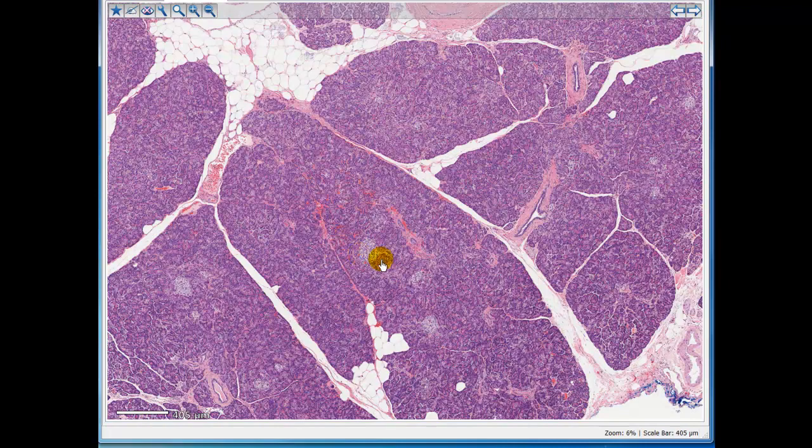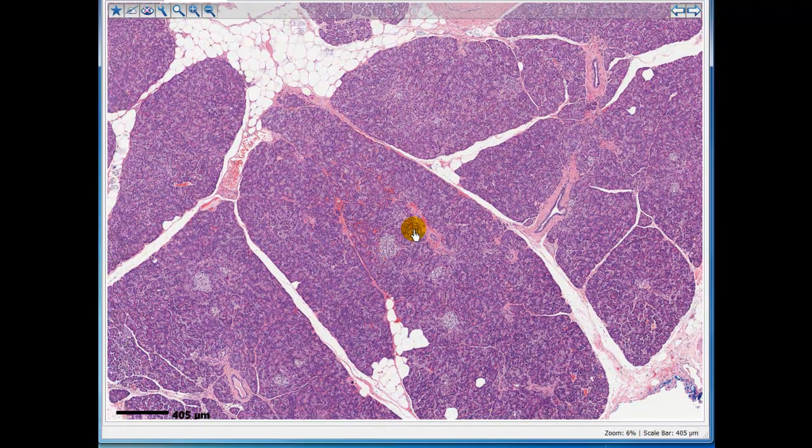So if we back up on this, I've mentioned epithelial tissue. I've mentioned glandular tissue that are producing the pancreatic enzymes. I've mentioned the islets that are producing these hormones. I've mentioned connective tissue and nerve tissue and some muscle tissue. So here we have an organ that is composed of epithelium, connective tissue, muscle, and nerve.